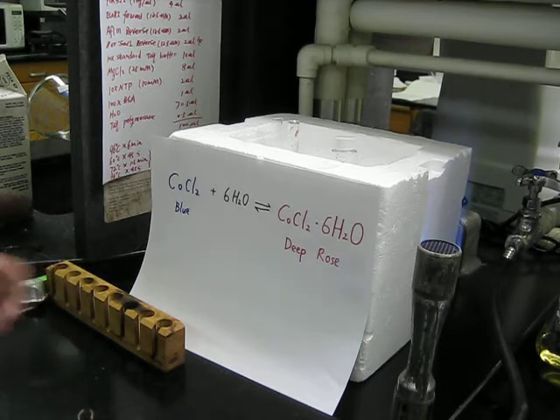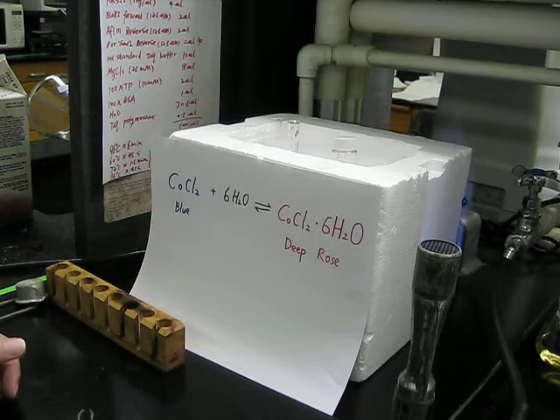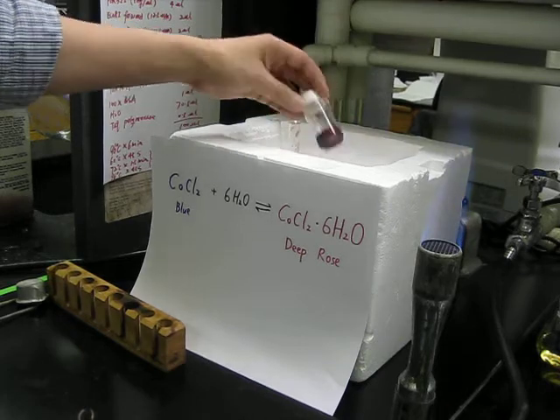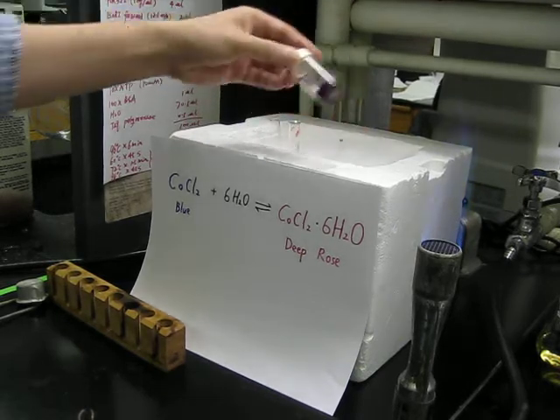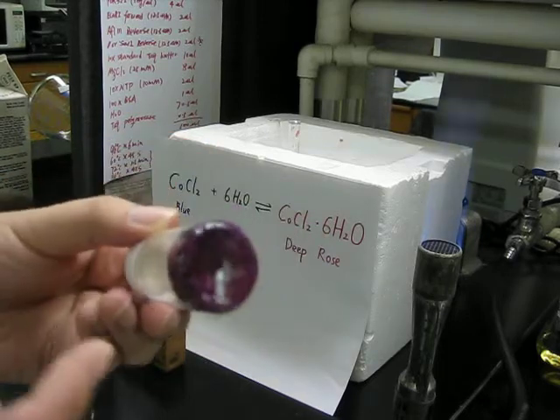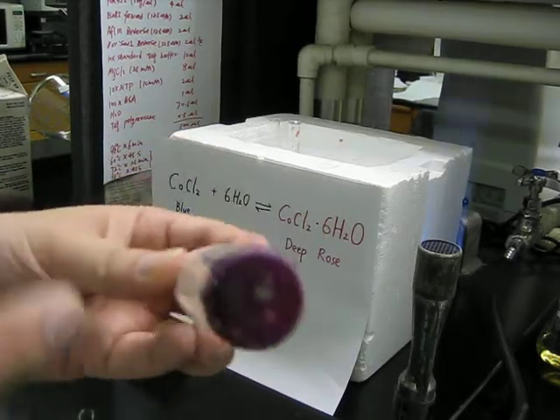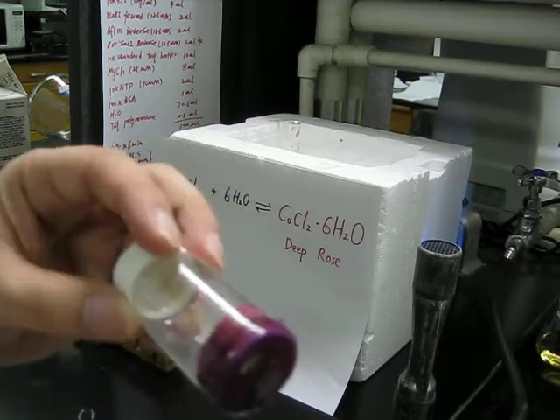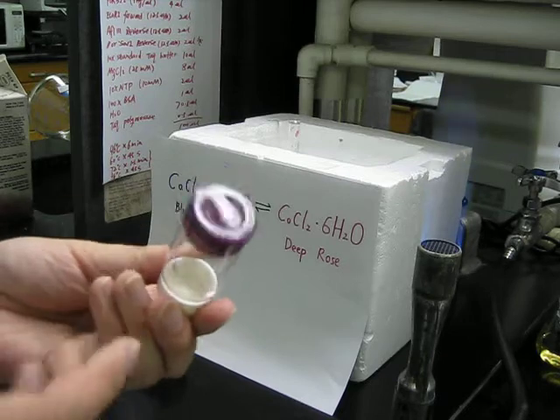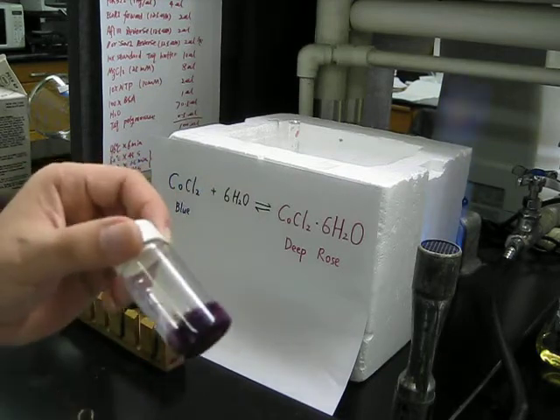Okay, so this experiment tells us the reaction for this type of reaction is quite reversible, and the reaction equilibrium constant here is kind of intermediate. Okay, let's see. If I bring out now, remember previously it was deep blue, but right now it becomes pale blue, and then if I wait for a little bit longer, you will see it will be all deep rose.